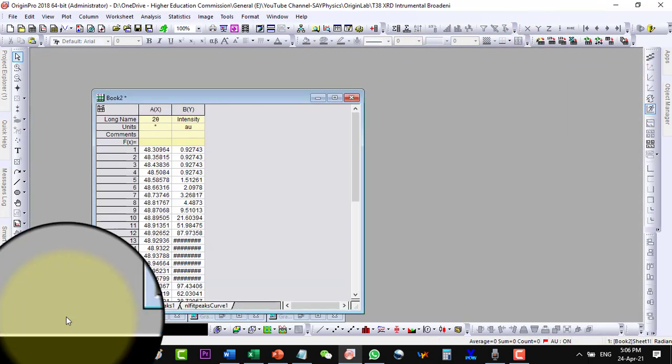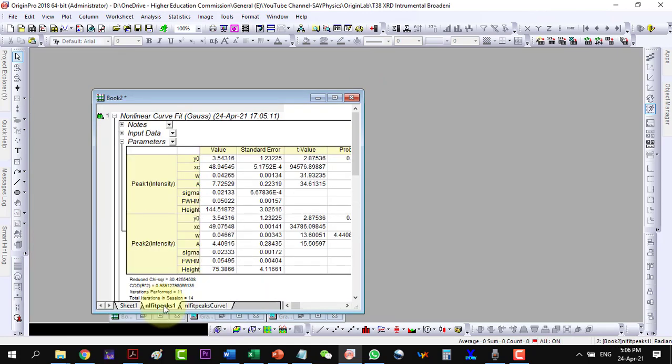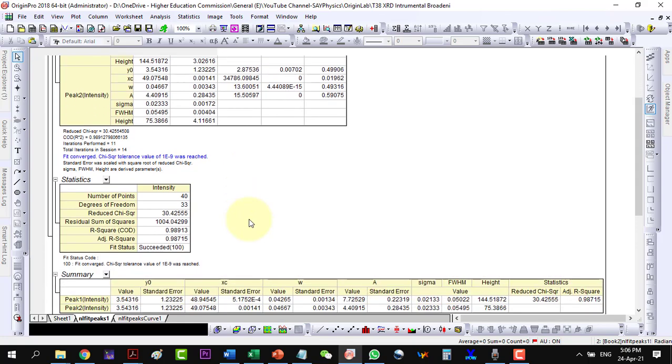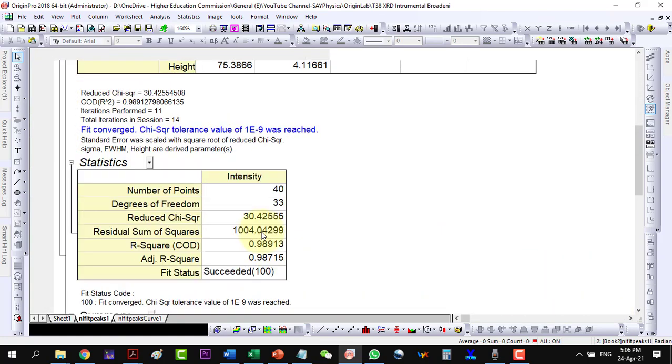Now, go to the data and copy the FWHM value of the first peak from the non-linear fit peak 1 under the summary table.